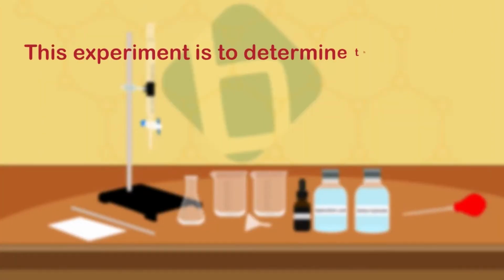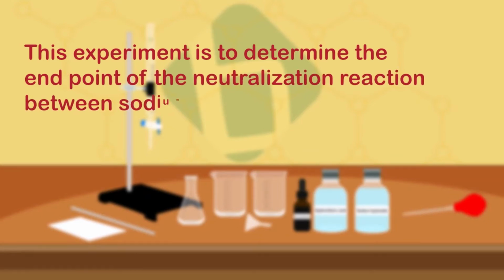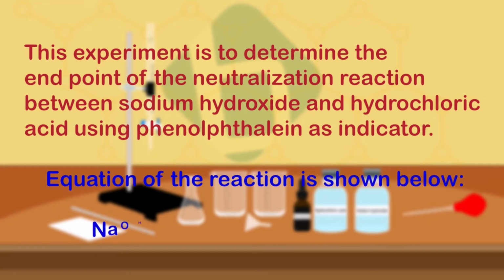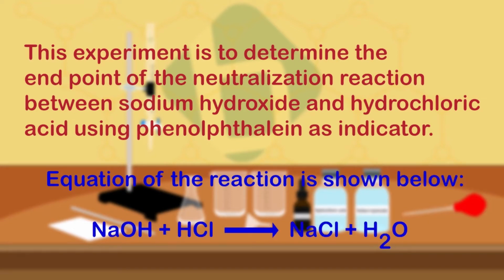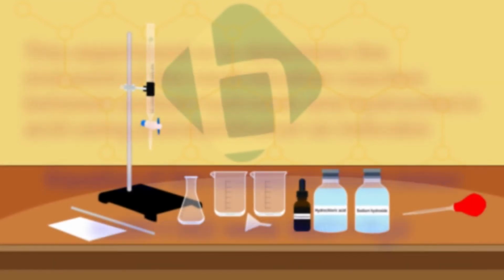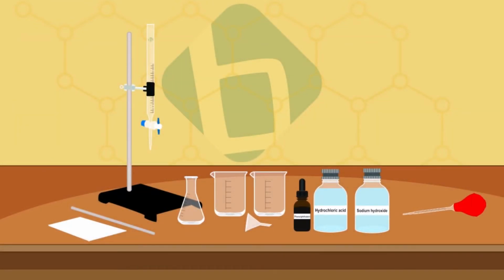This experiment is to determine the endpoint of the neutralization reaction between sodium hydroxide and hydrochloric acid using phenolphthalein as indicator. The equation of the reaction is shown on the screen. 1 mole of sodium hydroxide and 1 mole of hydrogen chloride react to form 1 mole of sodium chloride and 1 mole of water. To begin this experiment, we will assemble our materials first.